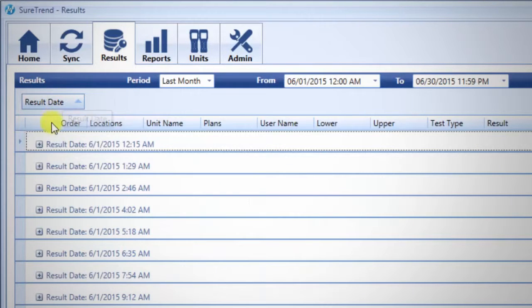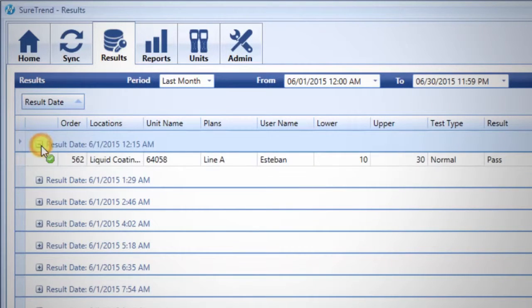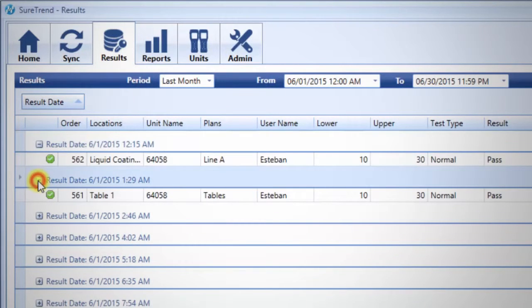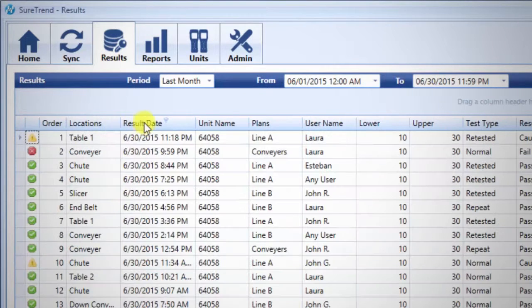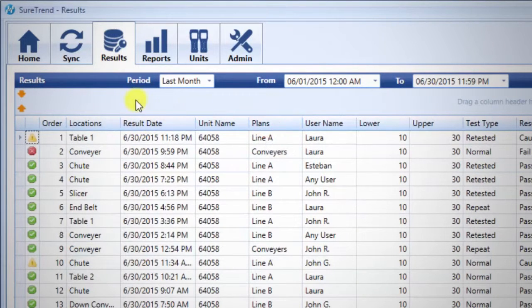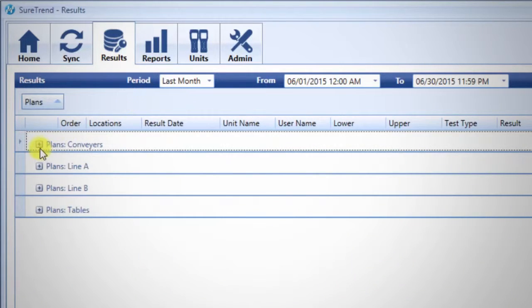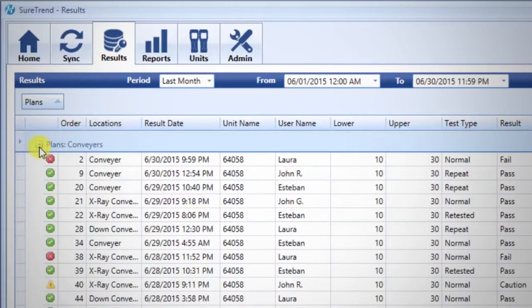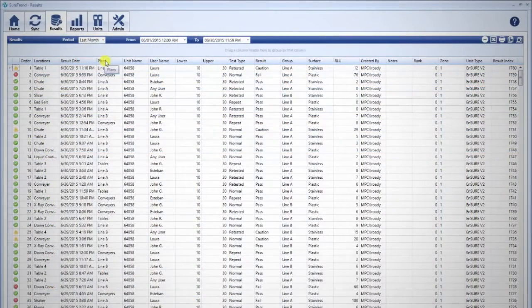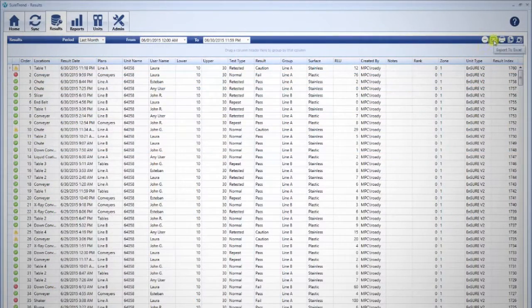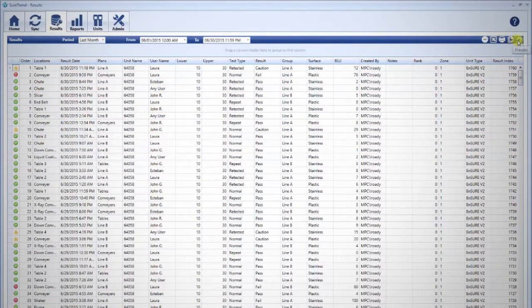Here you may quickly filter results by dragging and dropping the column headers into the space above the table. You may also export, print, and preview the data.